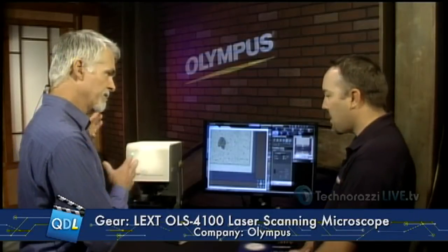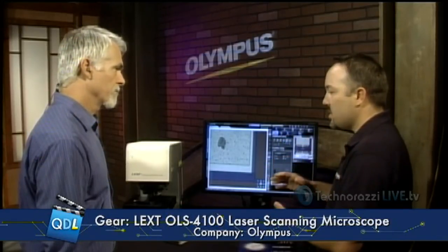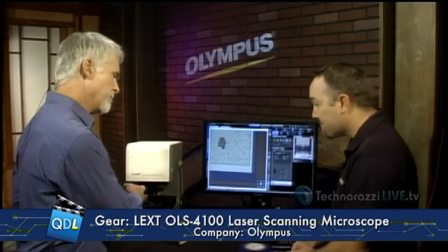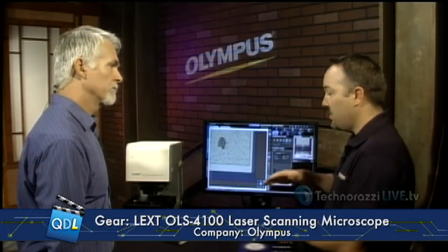Is this part of a series of products? This is in our metrology group — this is our high-resolution model. We also have what we call a tool maker's type microscope, a measuring microscope that's much more manual and low mag. This system is standalone for its resolution and capability for surface roughness. As for stage size, this system is our four-inch stage, capable of 100-millimeter tall samples — you can fit a Coke can under here. We also have a 12-inch larger stage version capable of fitting 12-inch wafers or larger samples as well, with the same exact optics, just a bigger stage.